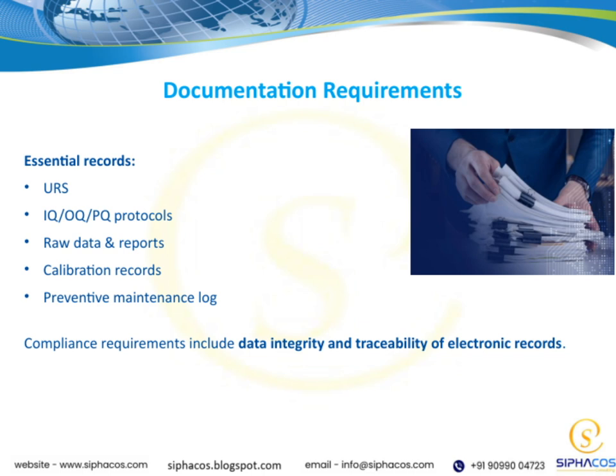Remember, compliance isn't just about having the records. It's about ensuring data integrity and traceability of electronic records. That means being able to track every change or update to data to maintain transparency and accountability throughout the process.